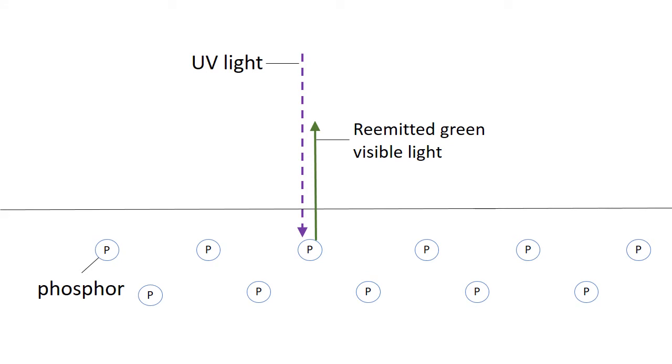The UV plate is coated with a phosphor. So when the UV light hits that phosphor, it's absorbed, and then it is re-emitted at a lower energy wavelength. In this case, it's emitted as green light. If a molecule is on the surface of the plate that does not absorb UV light, such as this alkene here, the UV light will pass right through, hit the phosphor, and will still emit the green light. So in a sense, this compound is invisible on the plate.